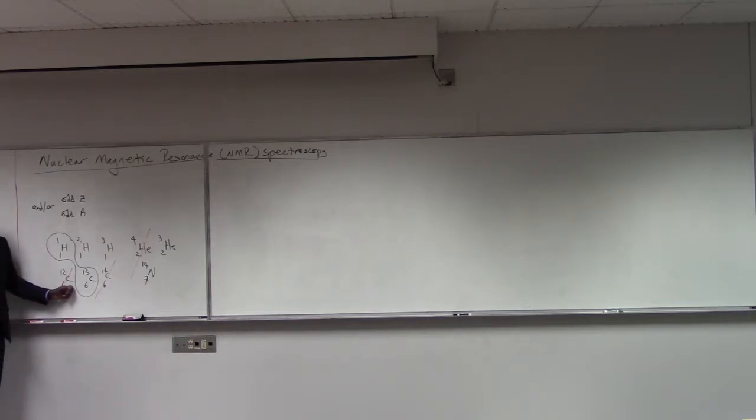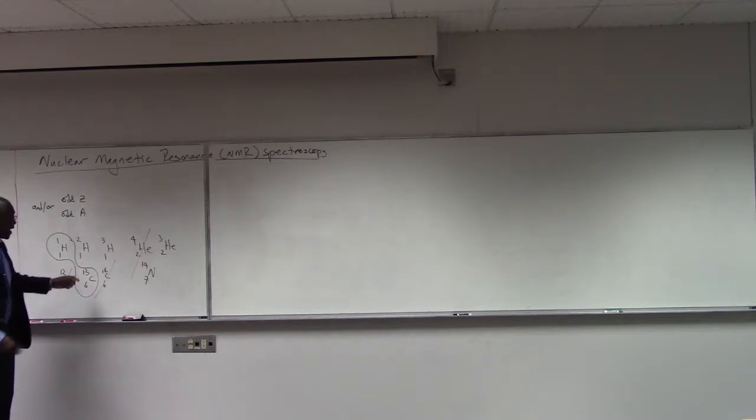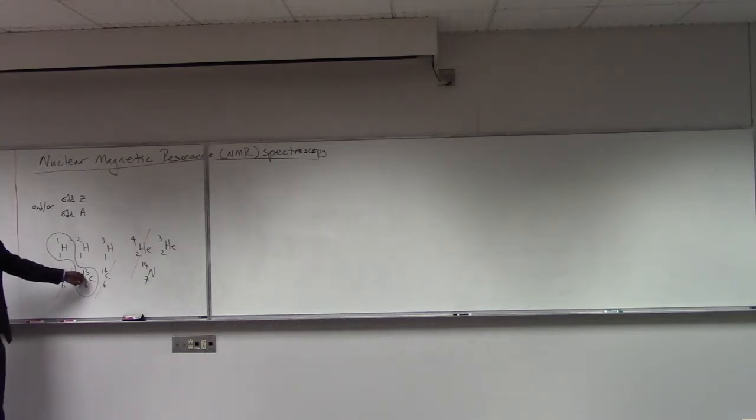Carbon-12 is by far the most abundant isotope of carbon. So carbon-13 is present in less than 1%, about 1%. And so the sensitivity of carbon-13 is going to be somewhat sabotaged because it's roughly 1 in every 100 carbon atoms that will actually give you the NMR phenomenon. So there is an immediate problem with lack of sensitivity in carbon-13, and that problem does not appear in the proton NMR spectrum.